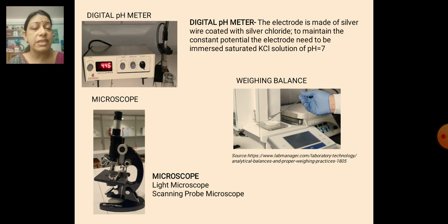Especially in gram staining, the basic requirement in a microbiology lab of an institute, it indicates whether the organism is gram positive or gram negative, and secondly we can also understand whether it is a rod or a cocci, which can be easily detected by the microscope. And remember, when we use a microscope, if the lens is not proper, we should always clean the lens with the help of acetone.